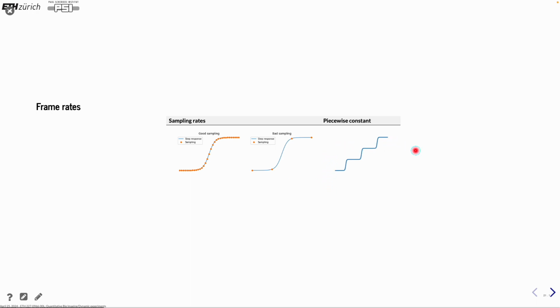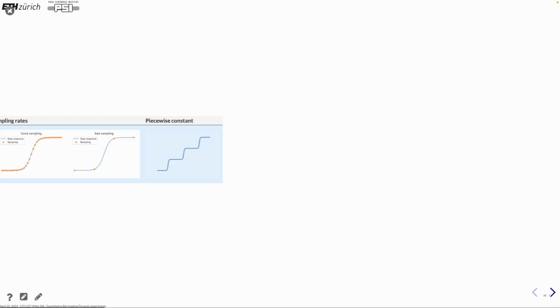Then there are some experiments you can do a stop and go. So you run the experiment, let it stabilize, do your images, then you make the next step, let it stabilize, do that image, and then you can see stepwise what's happening. In some processes that is possible, others you can't do this. And in particular, if you want to really see what is happening between step 1 and 2, then you have to speed up and take the cost mostly of very noisy images.